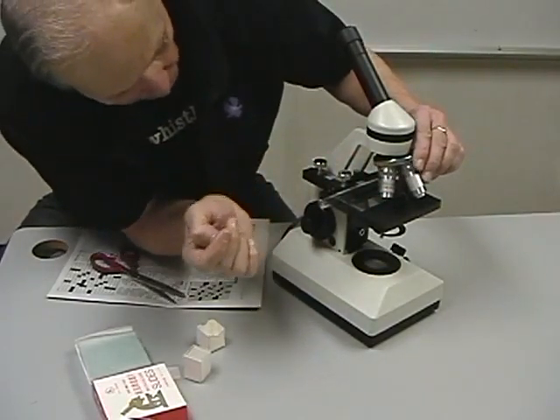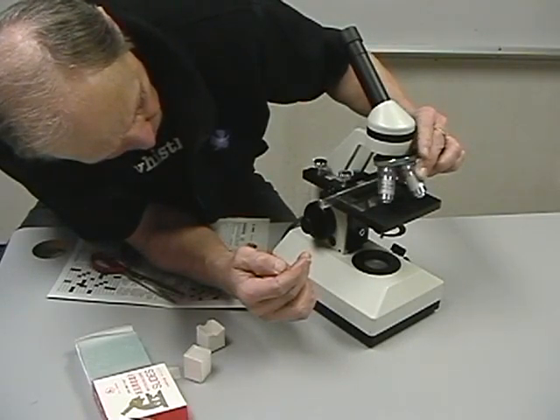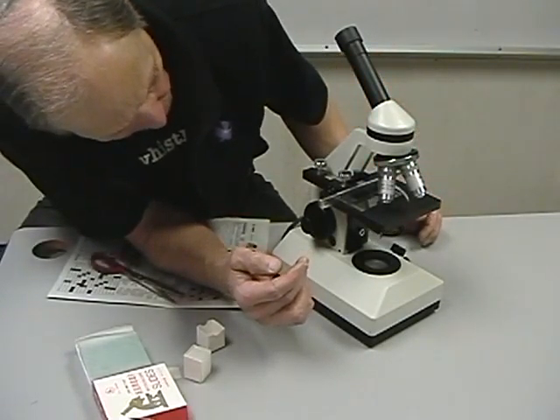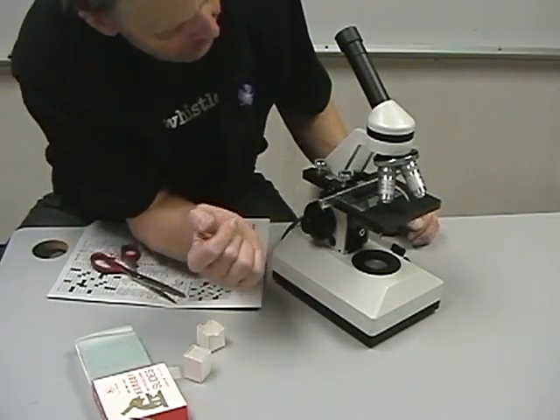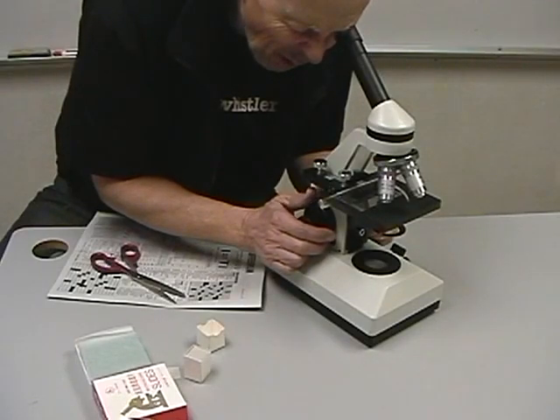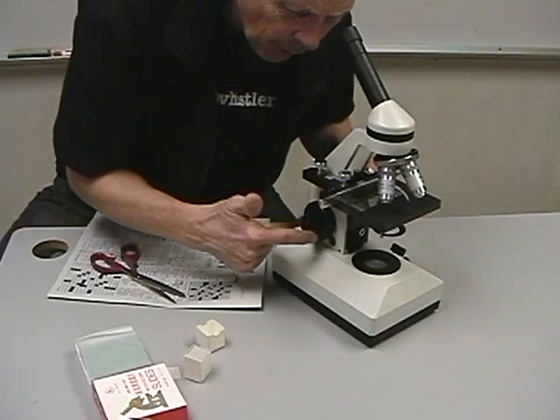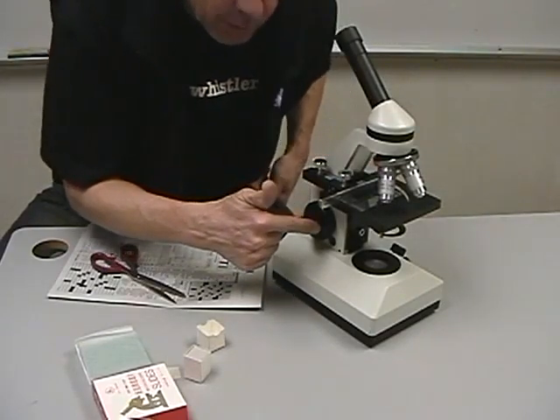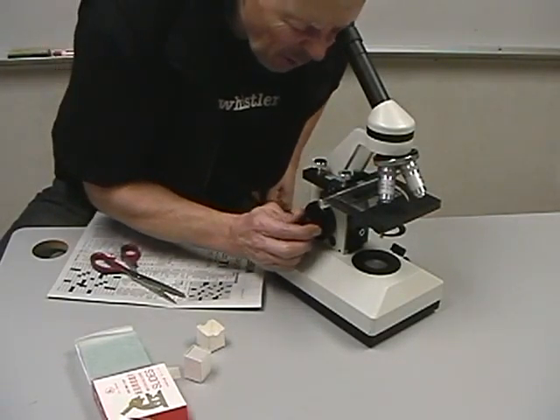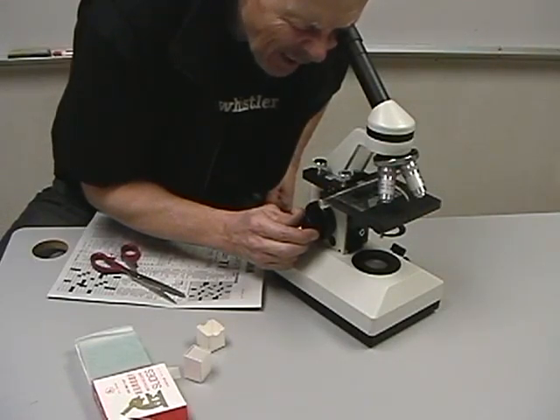So basically, with an angle from here, you observe that it does not touch the slide. We want to be careful we don't damage the lens or the glass slide. And again, it should be approximately in focus. You probably need to use these, well, you can see it from here, the fine focus. So use that and find your letter E in as good focus as you can, and there I have it here.